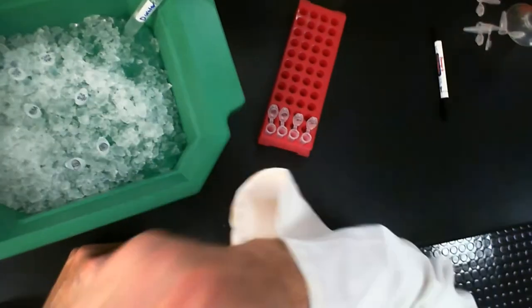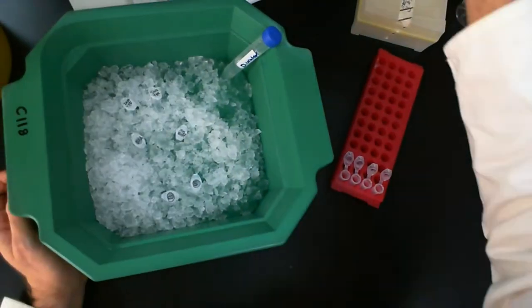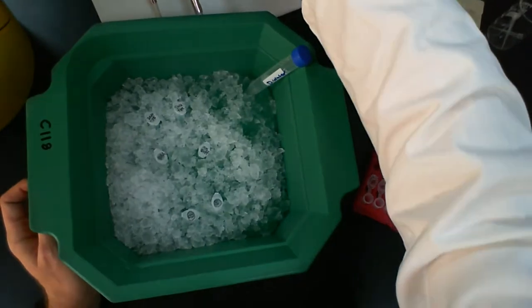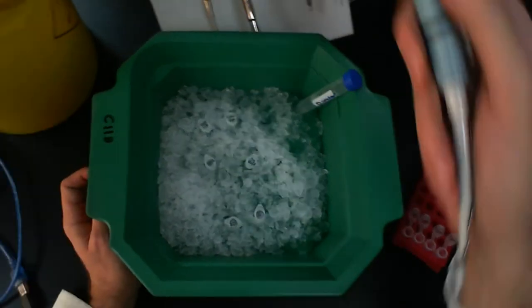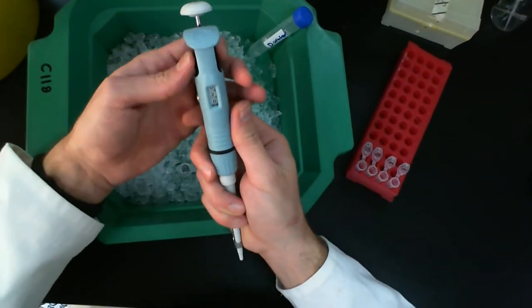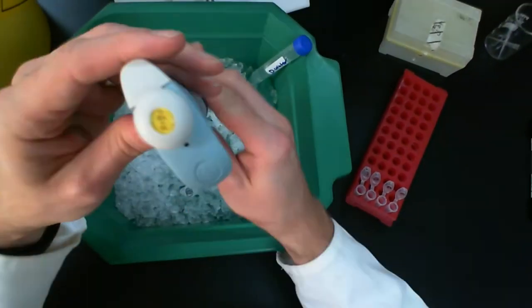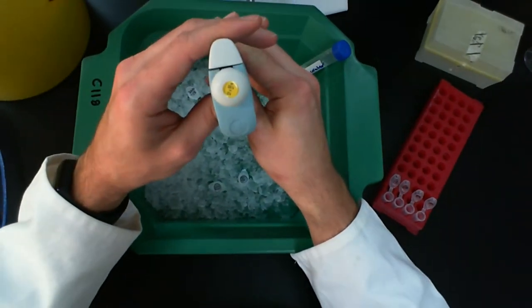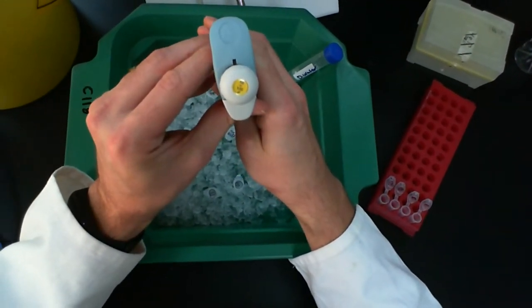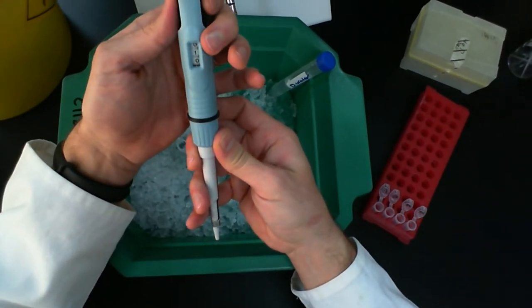Now what I need is to add water to these. Remember from your table you have 10 microliters or 12 microliters to add. So I'm going to add 10 microliters to my first set of tubes. This is a P100, and so 0, 1, 0, that's 10 microliters.